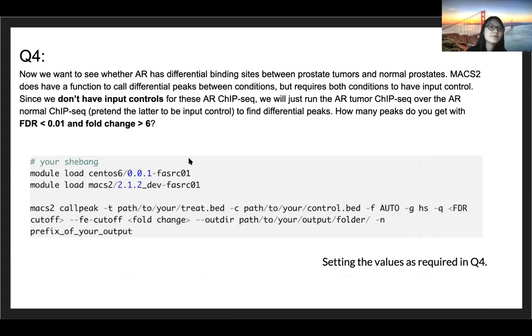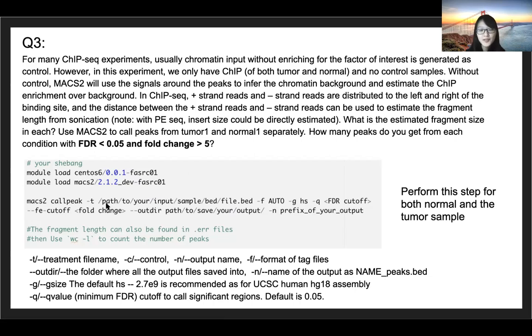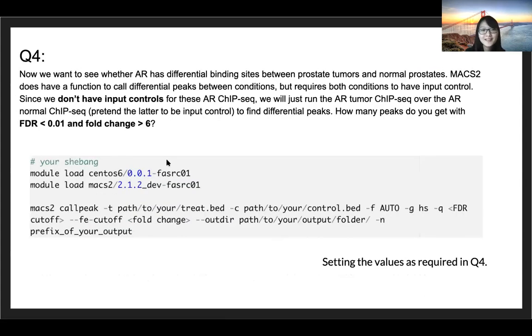For question four, in the previous step MACS2 can perform peak calling without a control. That's why we only have -t here but we don't have -c, because we don't have a control file. The normal sample is not the background DNA input control. But in question four we're saying, since we actually don't have that control file, you can just use the normal sample as a control. That's why we're doing -c and you can just put your normal file here. Then you can just change FDR and fold change to the corresponding values in this command.